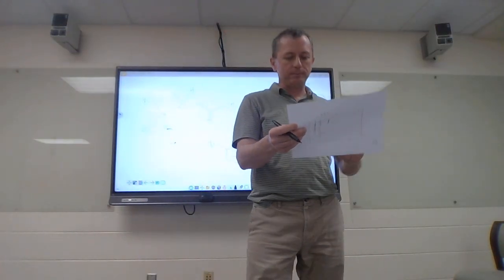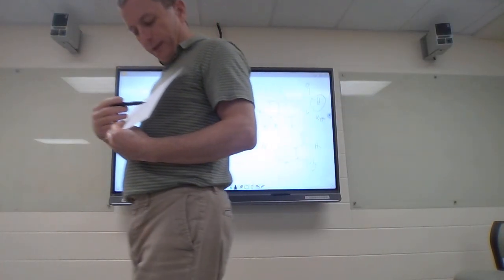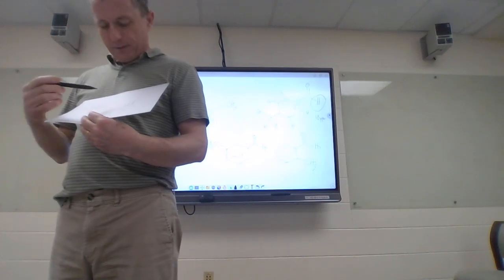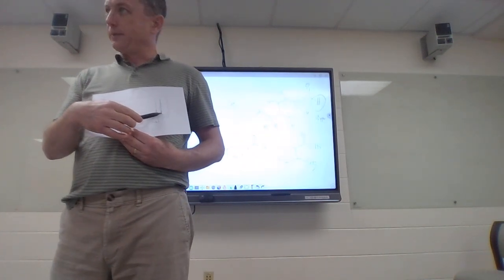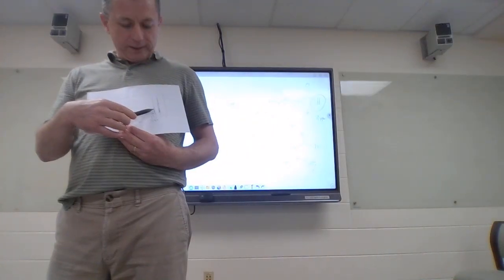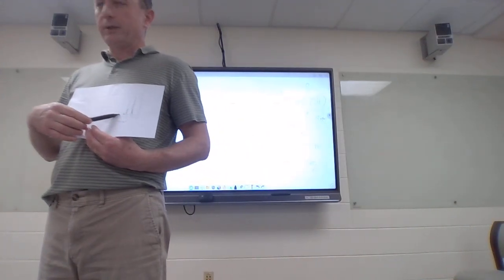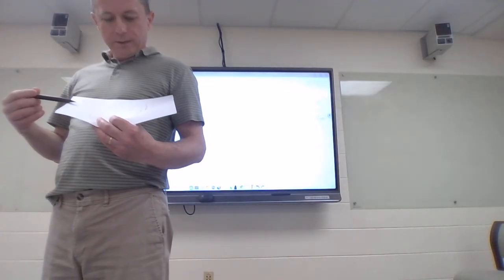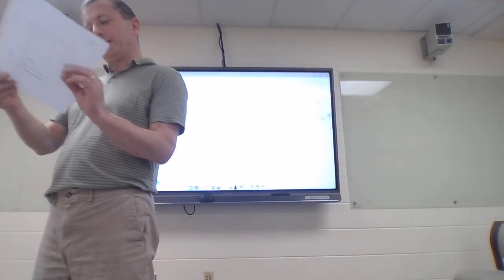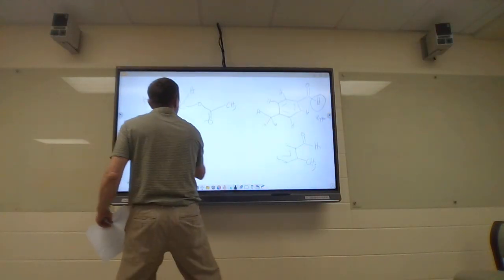that splitting. Okay. You see something similar here on 8. See the doublet of 6. You've got a singlet of 3, and then you've got this wild peak there, a bunch of peaks. Molecular formula is C5H10. I know you can just see this right now.